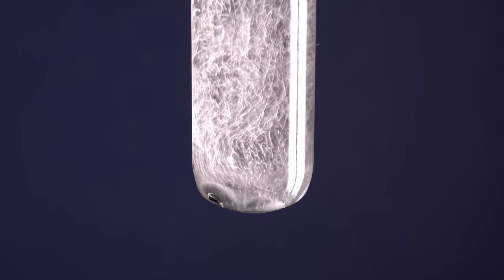Let's see now how much this acid corrodes metals and let's start with zinc. As an example, in hydrochloric acid zinc reacts very actively, but here in the concentrated hydrofluoric acid, zinc dissolves rather sluggishly. All because of the huge difference in the electronegativity of the fluorine and hydrogen atoms that make up this acid, and also because of the small size of the fluorine atom. In the solution, the fluorine atom does not release the hydrogen atom from itself, which prevents the formation of free protons in the solution. It is the ability to form free protons in a solution that can tell us the strength of an acid.